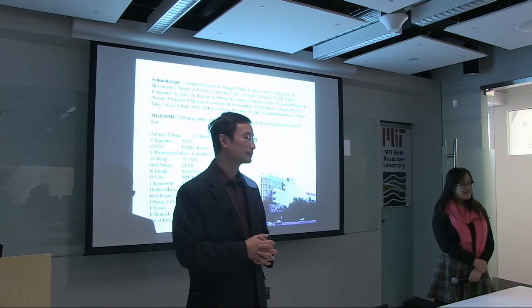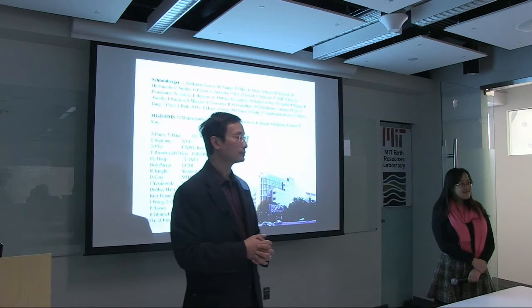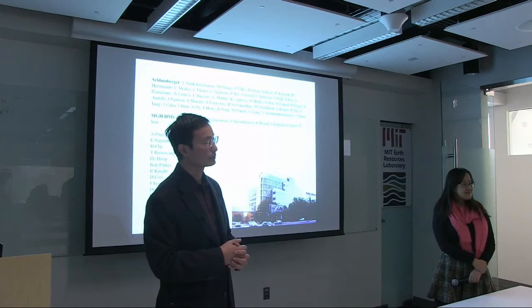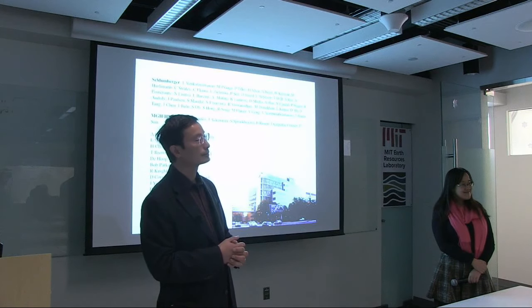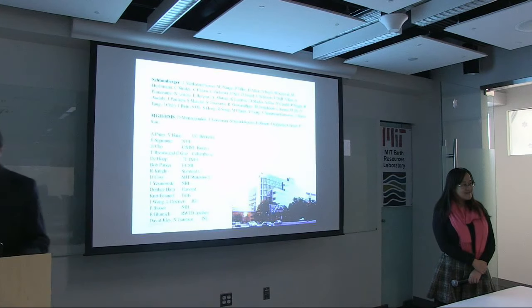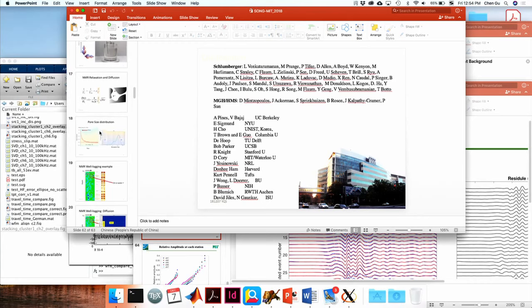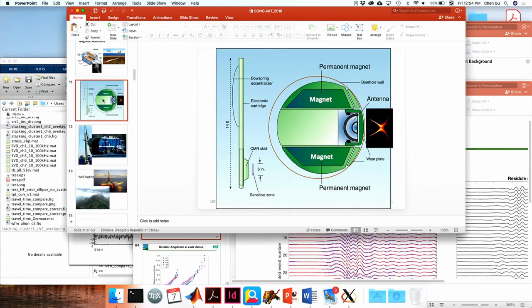Yeah. Back near the beginning, you had a nice slide that showed the diagram of the tool. And on the right side, it showed a spot. I think it would be helpful for this group, me in particular, if you could explain what that image is. I think it's probably the magnetic field, something to do with contours of constant magnetic field. Yes, I know that magnetic field gradients are very important in localizing things, but what exactly is displayed there in the black square?